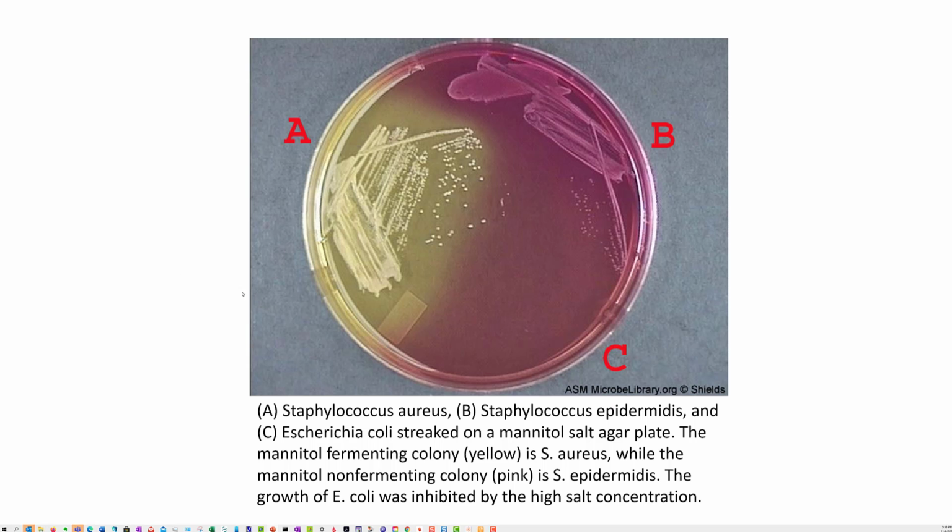Then again, you can see here's Staphylococcus aureus, Staphylococcus epidermidis, and then E. coli streaked on this plate. E. coli can't handle the truth. No, it can't handle the salt concentration, so it won't grow.